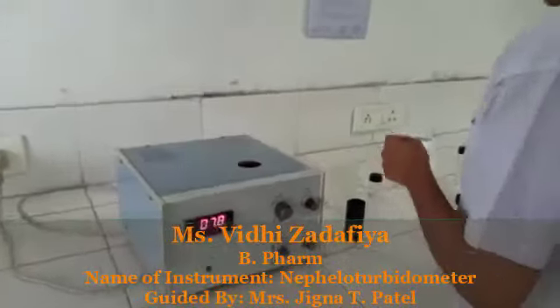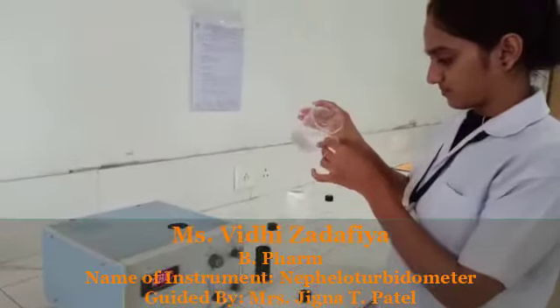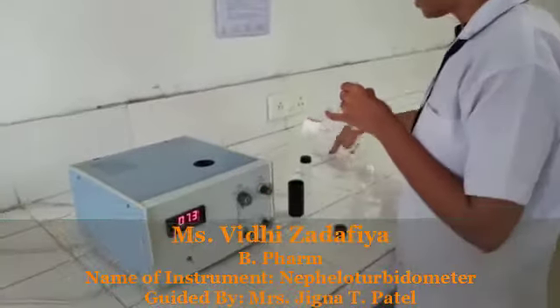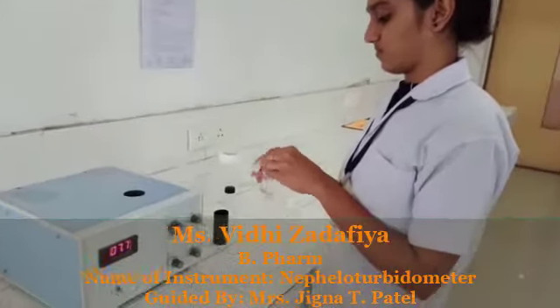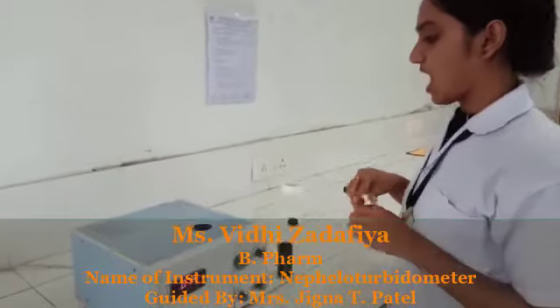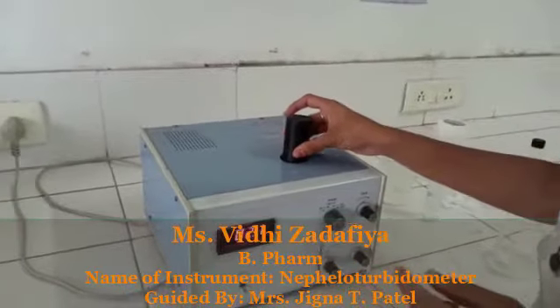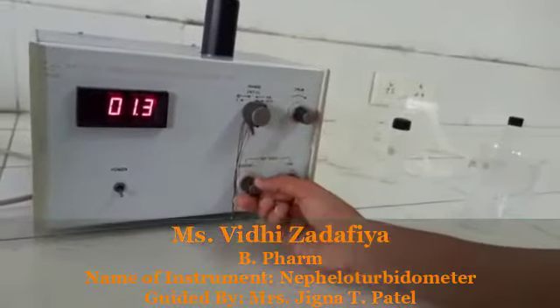First, take a clean cuvette and pour distilled water into it. Then clean it with the distilled water. Then put it into the instrument and cover with the light shield. Adjust the zero value with the help of the set zero.